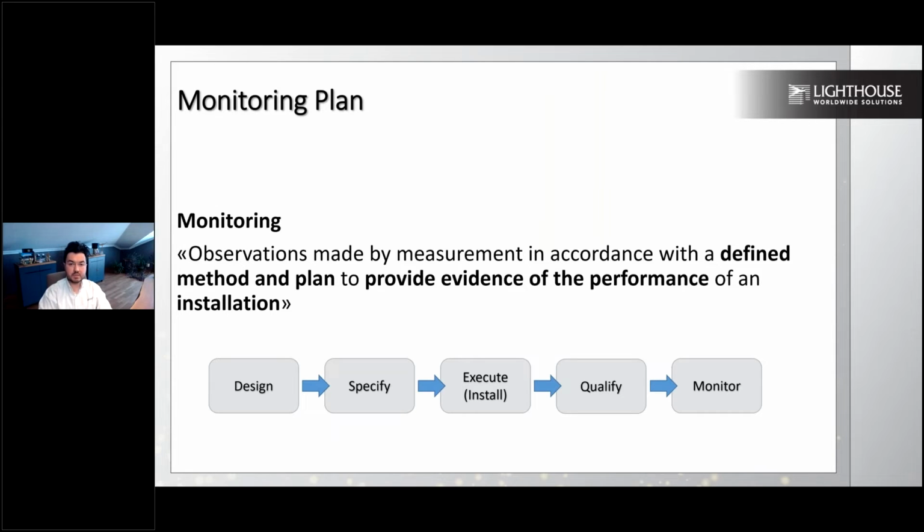The output of this monitoring system is in general the alarms that we are generating through the system, not only on the documentation side, but also during processes, during operation. We also warn our operators and the system in order to get this feedback as soon as possible so that operators can easily control the things which are out of limit.